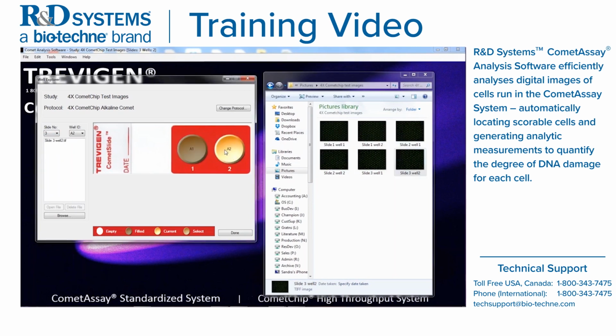So the important things to note are you can actually drag and drop multiple slides into a well depending on how many pictures you actually took. The type of image files that the software uses are TIFF, JPEG, or PNGs. Some other useful information in this window is you can actually highlight the slide. If you made a mistake dragging the image into the well, you can always delete the file. And if you'd actually like to see what the picture looks like, you can actually open the file. You also have the option that if you don't want to drag and drop, which I actually think is the most useful, you can always browse for your individual images in order to load them into the well. All right, so now let's select Done.